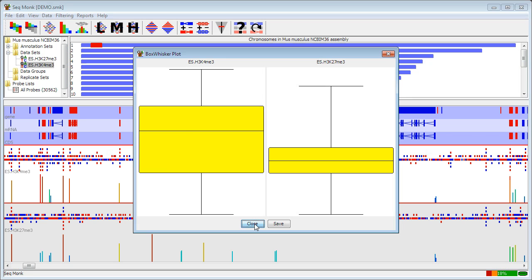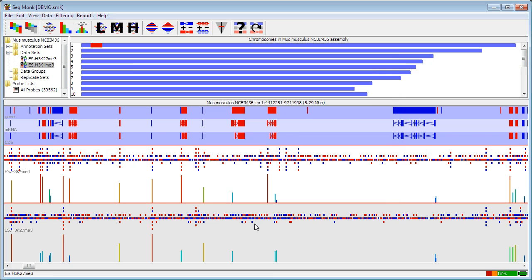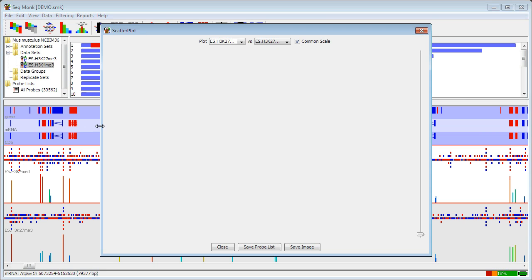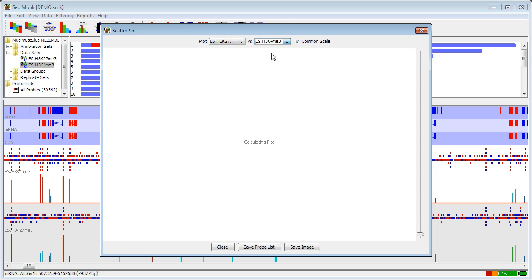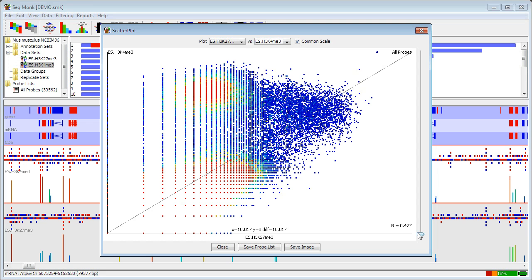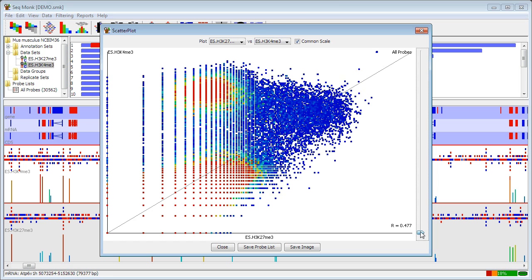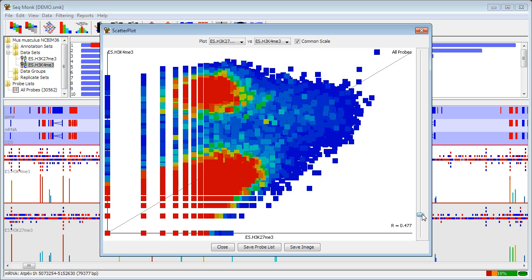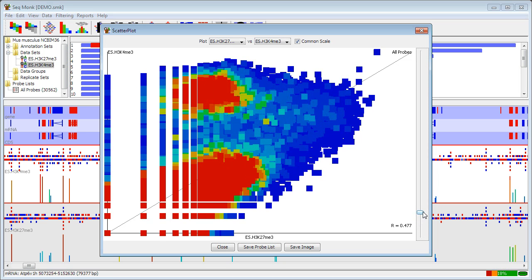If I only have two data sets that I want to compare I can do a scatter plot. So if I go to view and scatter plot I can select the two data sets I want to view. Use the little slider on the right to make the boxes bigger and I can immediately see that I have two distinct populations on here. I have a population which show similar levels of enrichment in the two data sets but then in here I have a set that are specifically enriched in K4.